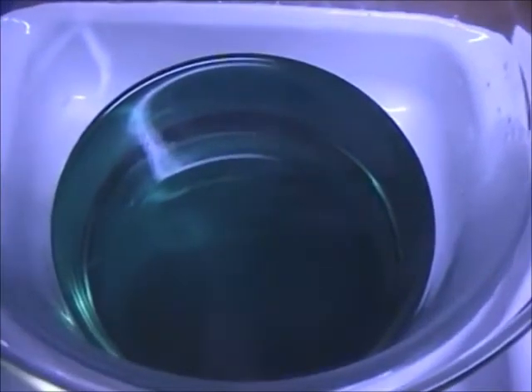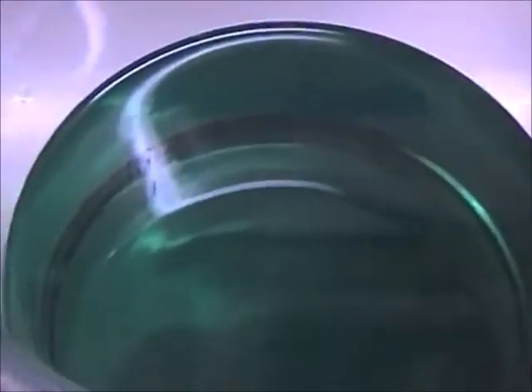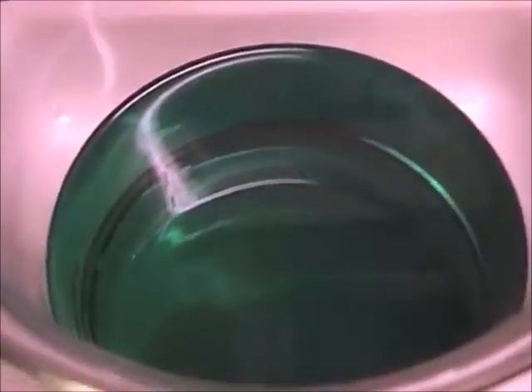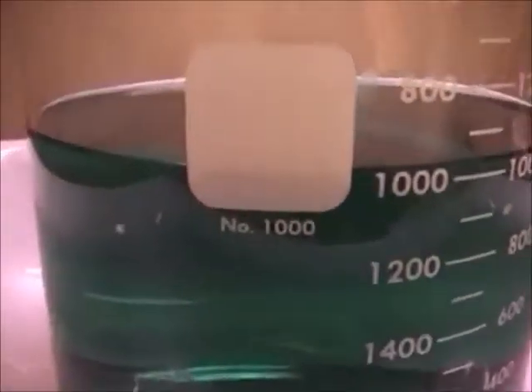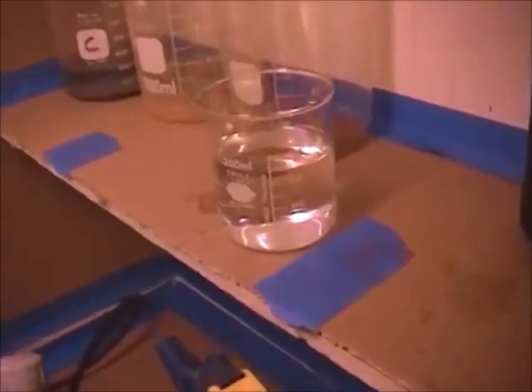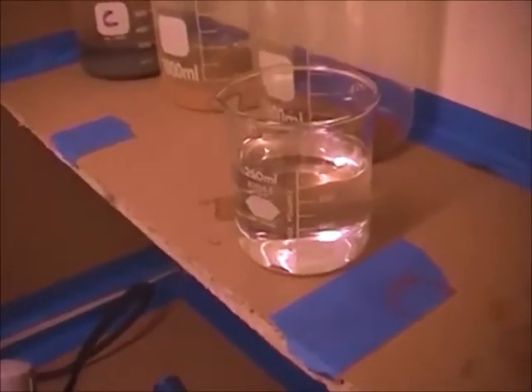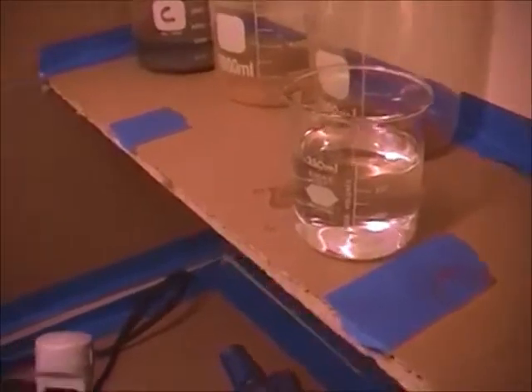If you'll look, you can see how clear this solution is. You can actually see the bottom of the beaker there, and you can see straight through the solution. What we're fixing to do in a minute is have our saturated sodium formate solution up here, and we're going to add that to our silver nitrate solution to precipitate our pure silver out.